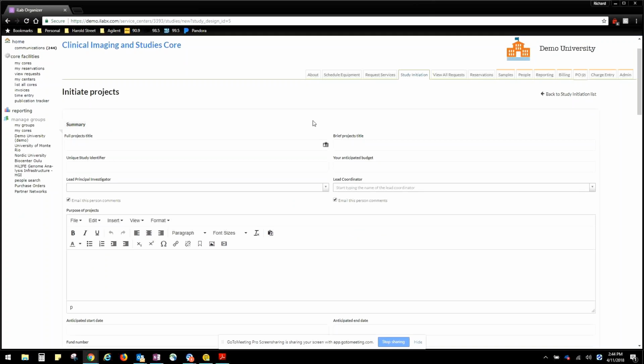Is that turned off in general, or turned off temporarily while you're working this section, or is that turned off just for this study?